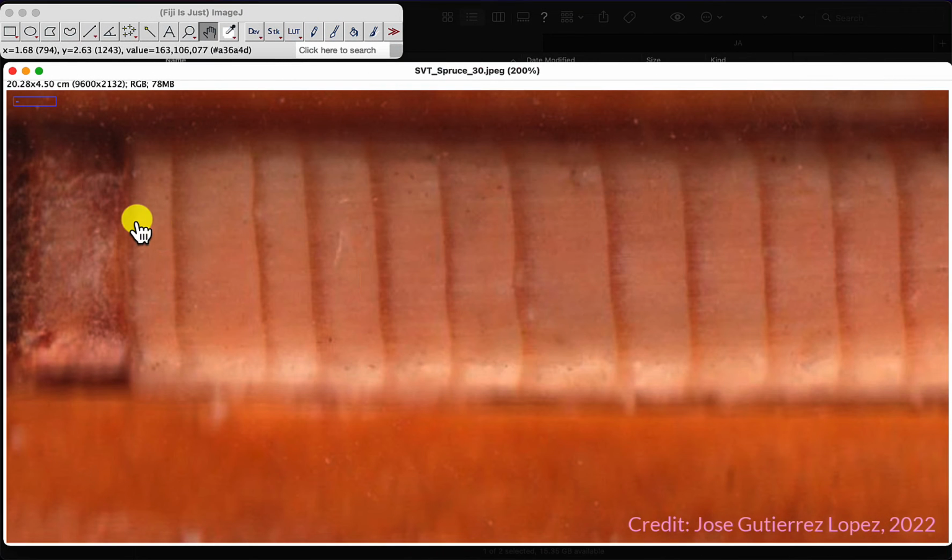First things first, we took this sample in November. Because of that, we know that the last ring, or this part here, is the late wood that was already forming in November. We took the samples mid-November, I think. So we are very confident that all this is 2022. And so what we do is literally just point and drop where we believe the next ring starts.